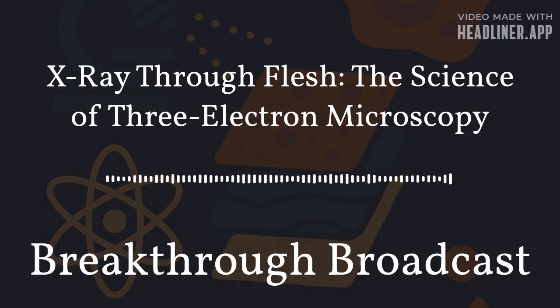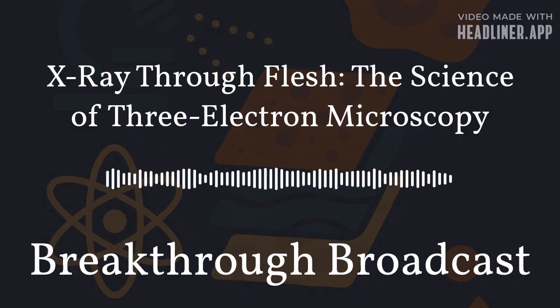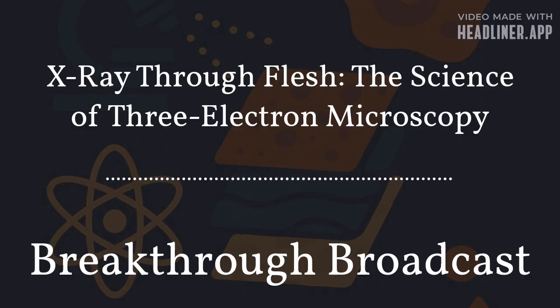Instrument design plays a critical role as well. The microscope must precisely control the electron beam's focus, energy, and angle of incidence. Misalignment causes distortions when the three signals are merged. Specialized detectors isolate each electron type, so their signals do not interfere. Advanced calibration routines compensate for beam drift, charging effects, and slight variations in sample thickness.